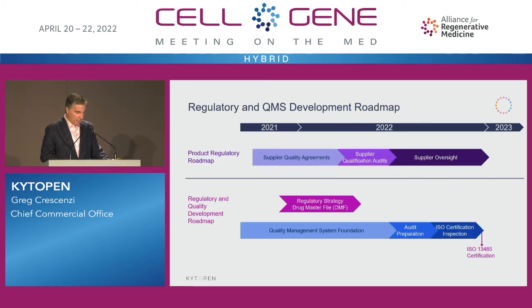Our product development effort has been supported and enabled by our quality and regulatory path. We are building towards an ISO 13485 quality management system for the end of this year, as mentioned, and that will provide us with the rigor in our supply quality oversight, get us ready for and able to conduct audits, and, as I mentioned, to submit that drug master file in support of the GMP and clinical readiness.